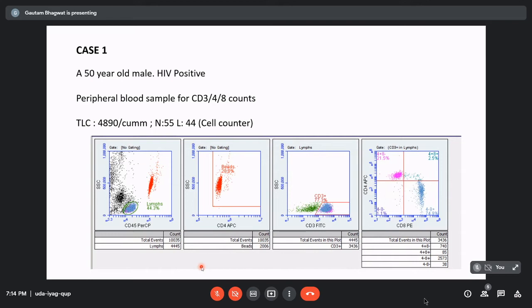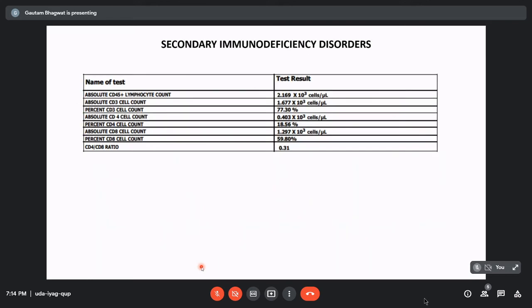So for this we would do reverse pipetting. In that, we push the pipette button entirely to the bottom, take the blood filling the tip full, and then press till the first stop. So for example, I have set 50 microliter in my pipette. When I press till the first stop, only 50 microliter will get out, and the rest I can discard. So this ensures that the exact amount of blood has gone into this analysis, and this is important because we are going to give absolute counts.